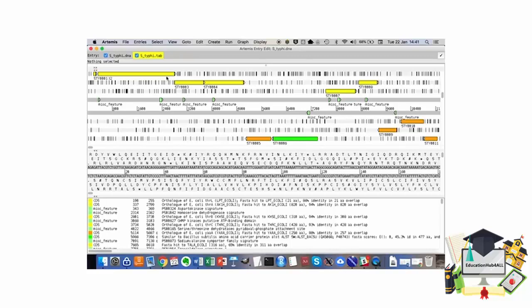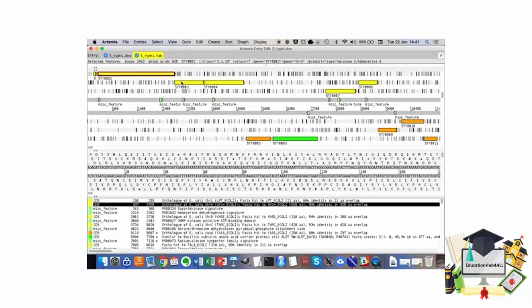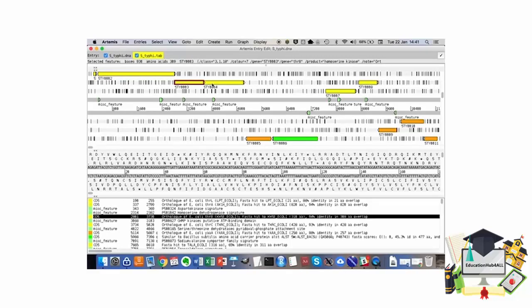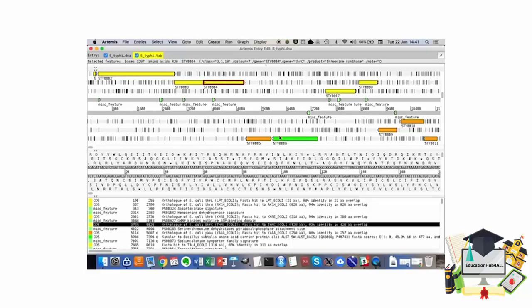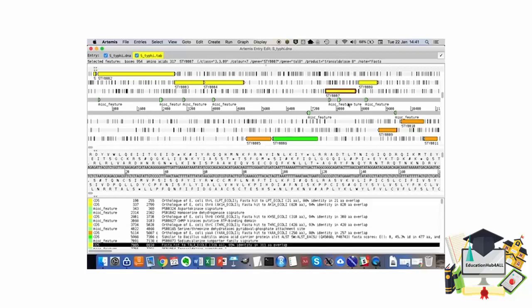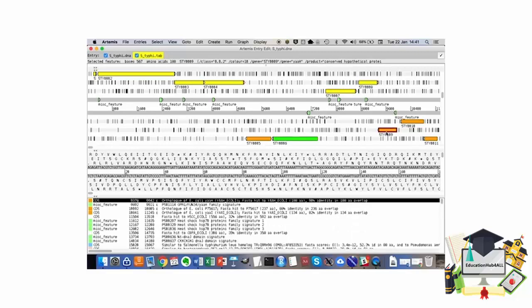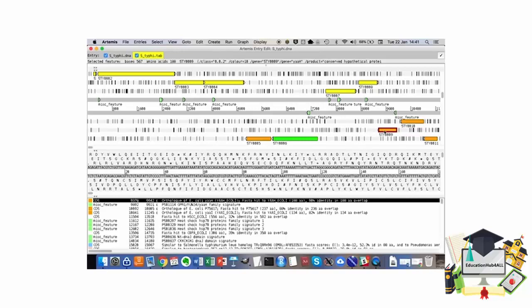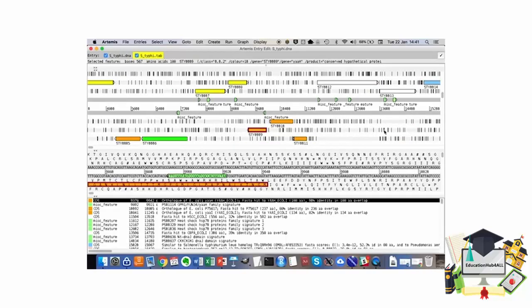You can see the different CDS's in different colors. As I click on the different genes, they get highlighted, and it also highlights in the annotation panel here at the bottom. Remember that if we double click on one particular CDS feature, then all the windows are going to be centered on that particular CDS.